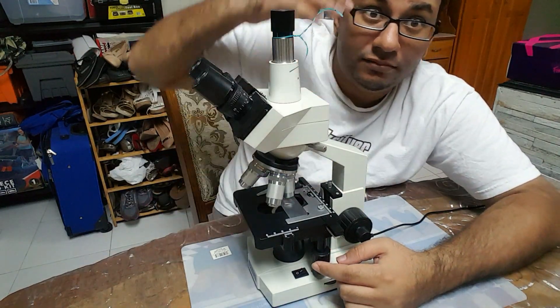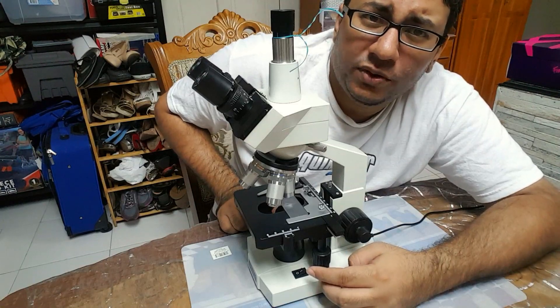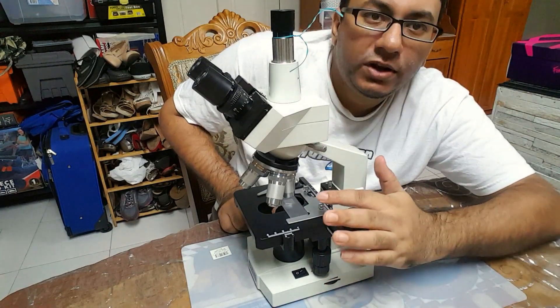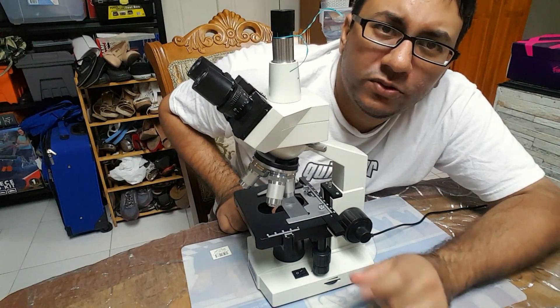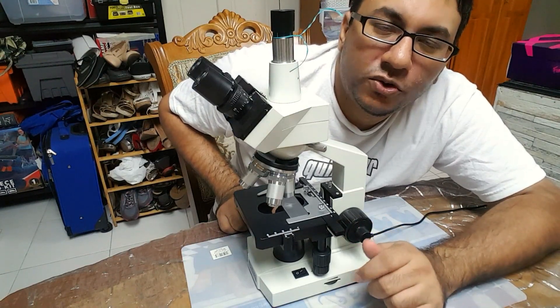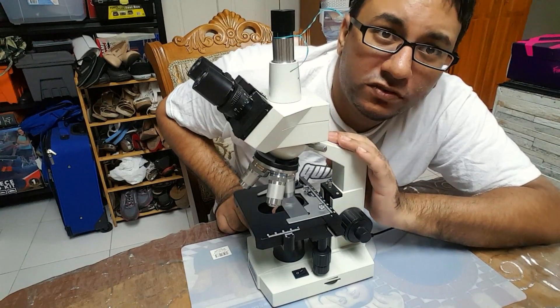A microscope is really just a telescope — arguably overpriced. The real value is in the electronics: the camera and the light. That's pretty much what you pay $300 USD for. For me, converting to my local currency that came to nearly $2,000, plus $1,000 to import it, so I paid about $3,000 total. Is it worth it? Maybe if you really need it. It does not come with slides — you have to buy your own slides and dyes. It's made of cast iron and weighs about eight pounds, so it's quite heavy.